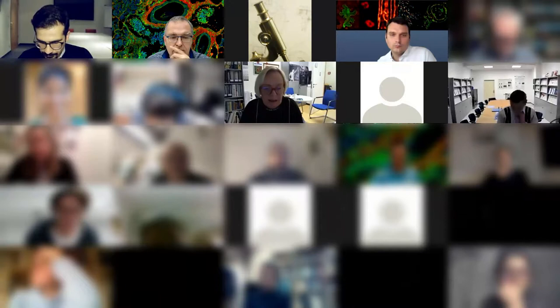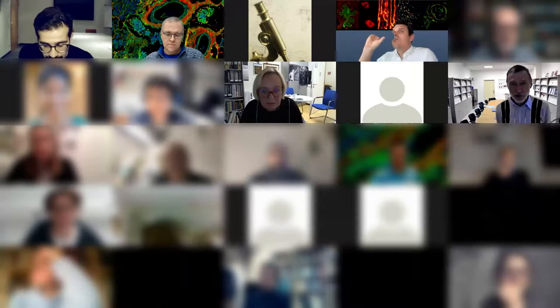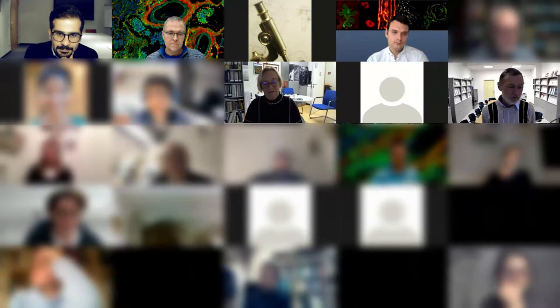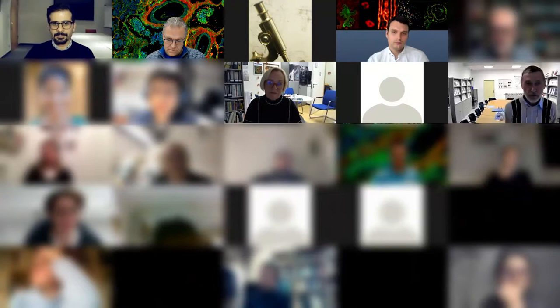That would be great. If you can share it with us, we can send it to the participants as well. Just one additional remark here: Wolfgang, Connie, nice to hear you here or to see you. Of course it's understandable that there's concern about toxicity, because the quenching effect of the phosphorescence is the creation of singlet oxygen, and singlet oxygen is not quite healthy to the cells. But in comparison to photodynamic therapy, we are creating just a very, very little singlet oxygen. So effectively, you don't see any light-induced cell death or anything. I can confirm this. But the concern is certainly justified.